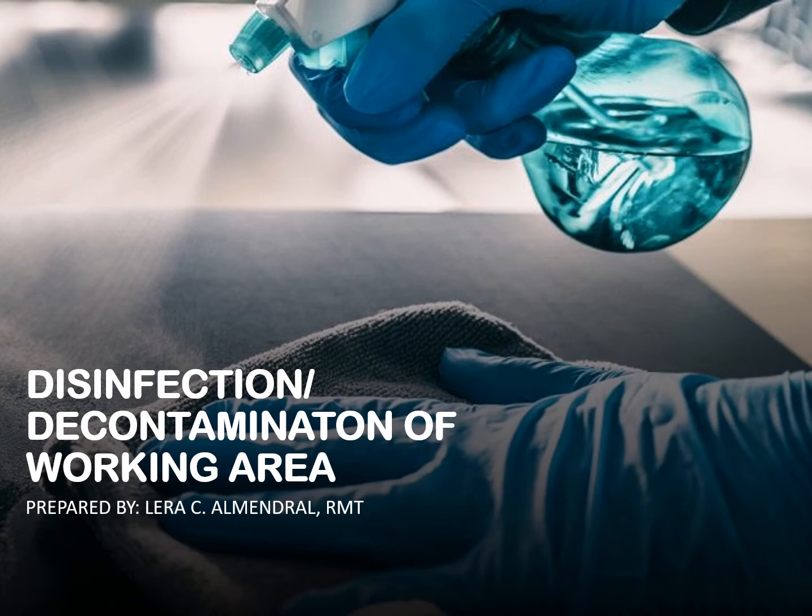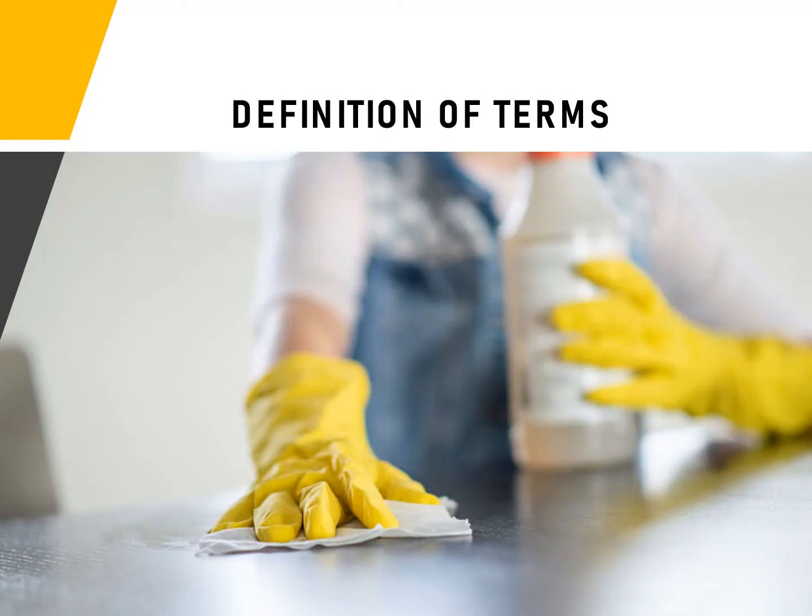Therefore, a thorough discussion about disinfection will introduce us to the different methods and disinfectants that can be used to eliminate contaminants not only inside the laboratory but also at home. First, let's define some terms. So in this slide, we can see four important terms that are related to disinfection or decontamination.